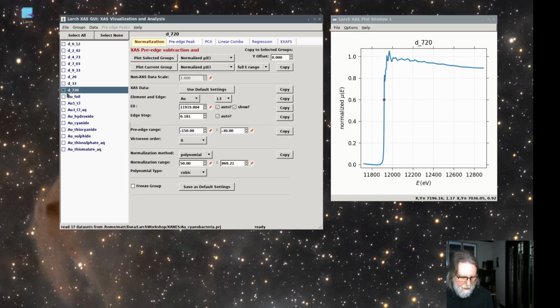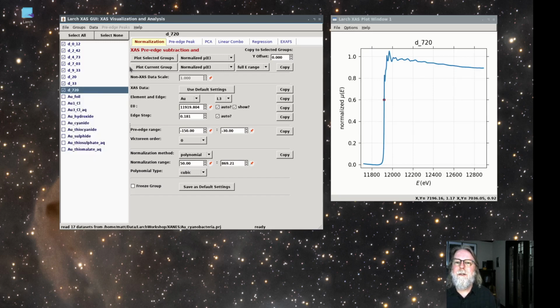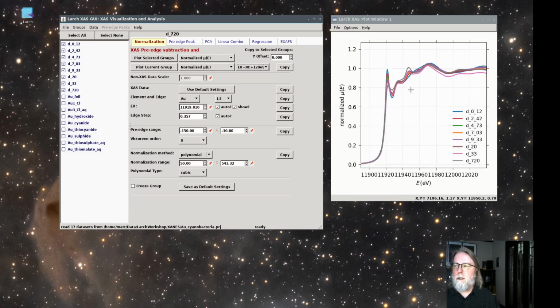So here we have a series of unknown spectra, or unknown to us spectra, that look like this. If I plot those over this range, there are a lot of similarities between these spectra, but some variations. And so one of the questions you might ask for the unknowns measured here is how many different components are there?